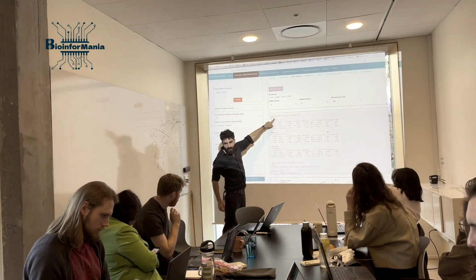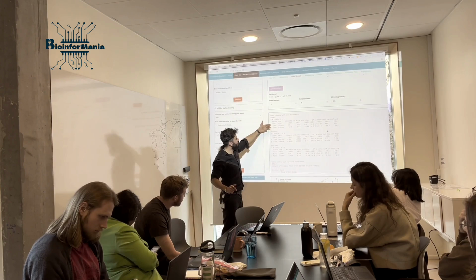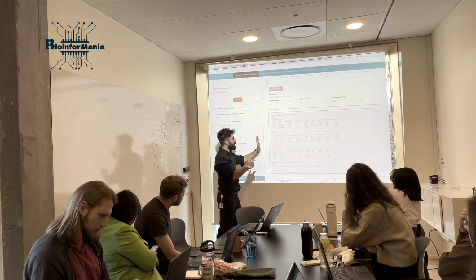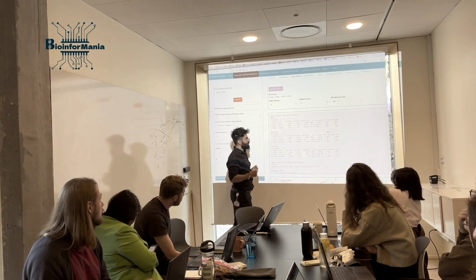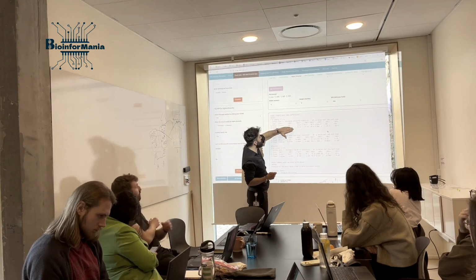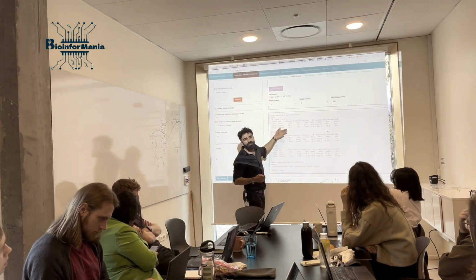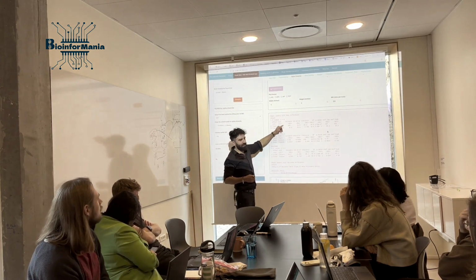This is for CHA-1, the alpha diversity for richness, and here you have the intercept for your linear model, and then the slope for your treatment. If you don't give them anything, this should show. This is protozoa compared to the naive.